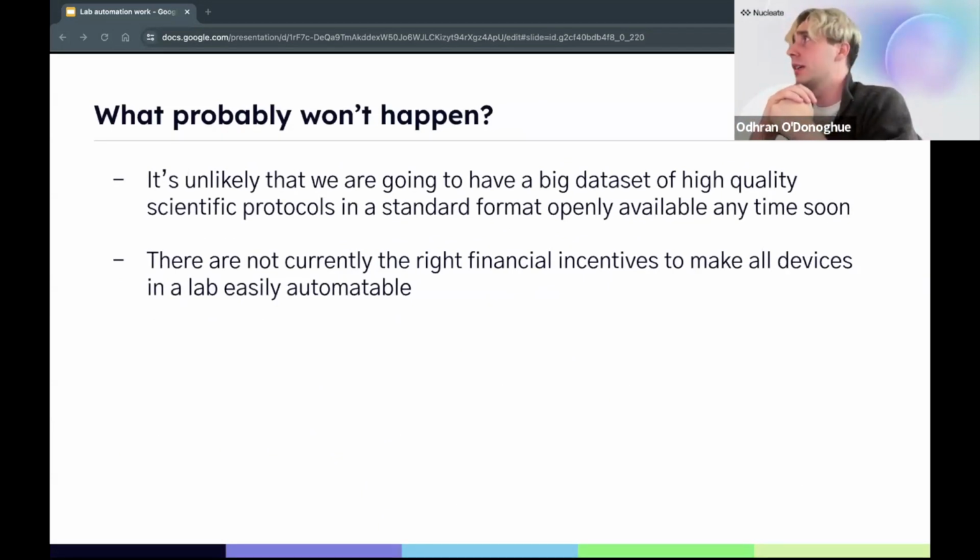It's unlikely that we are going to see lots of custom built lab automation devices, I think. There isn't really the financial incentive for this to happen. And as nice as it might be to have all these different lab automation devices, we've seen a lot of companies try to build full stack lab automation things over the last few years. And none of them have taken off in the way they're perhaps hoping to. I mean, that's maybe unfair. As I said, this is a future prediction. This is my prediction. I may be wrong. But my 2 cents is that we are not likely to see full suites of custom built lab automation technologies.